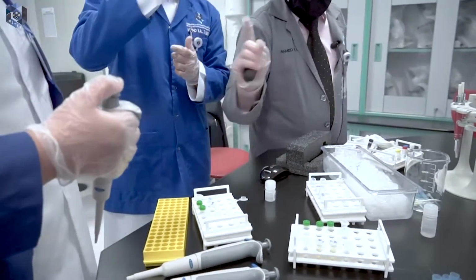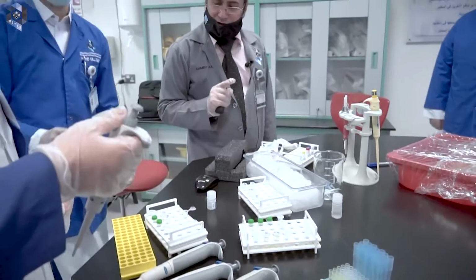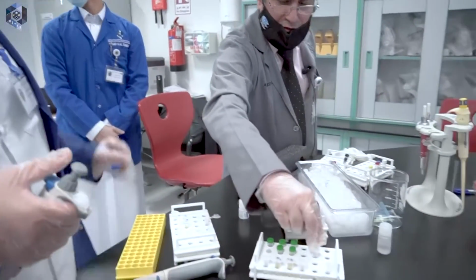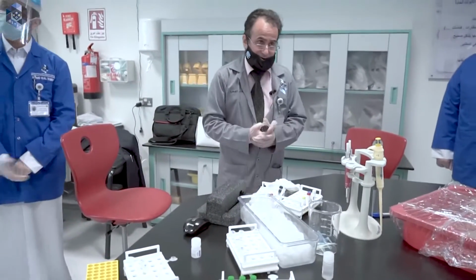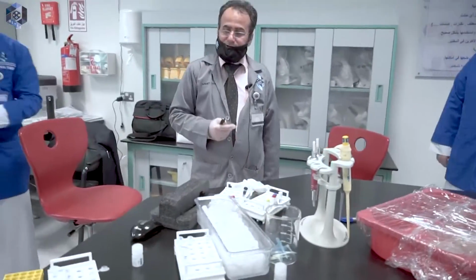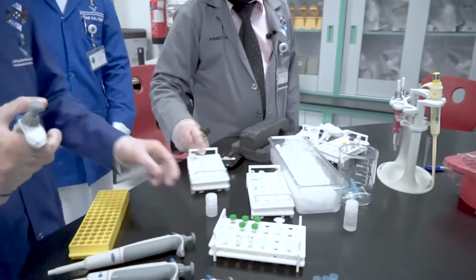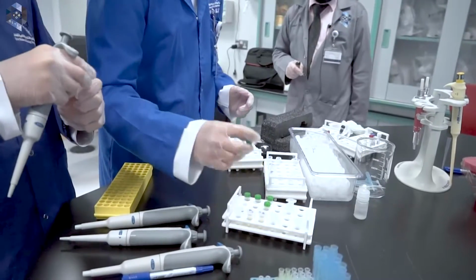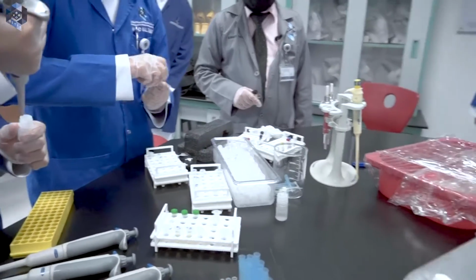Good. Now, I want you to add 45 microliters more of highly pure water to these green capped centrifuge tubes. I want another student to do this step. Who would like to participate? Come. So this is the distilled water. Take 45 microliters and add them to this. Help him open these centrifuge tubes. All of them.